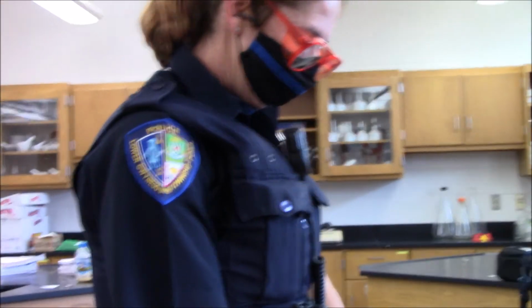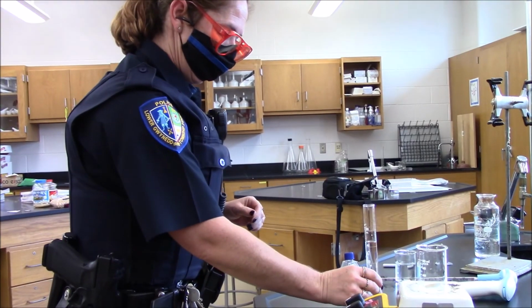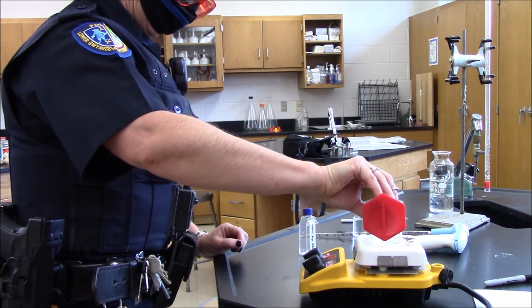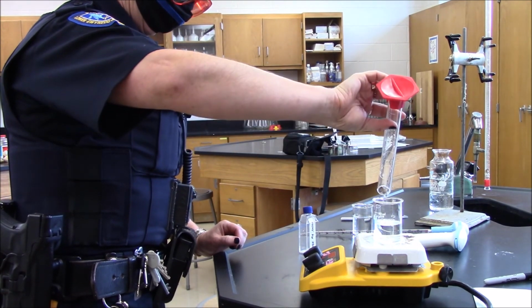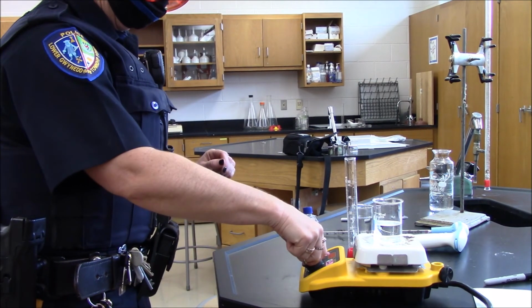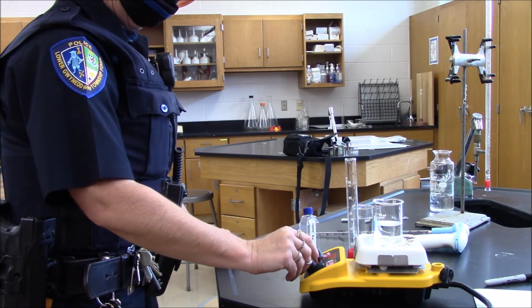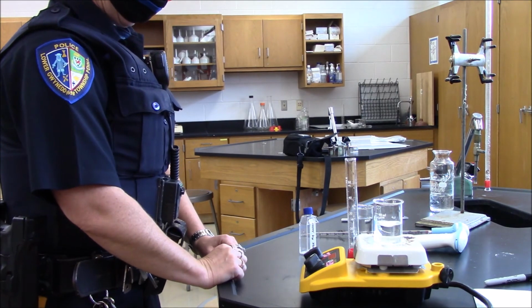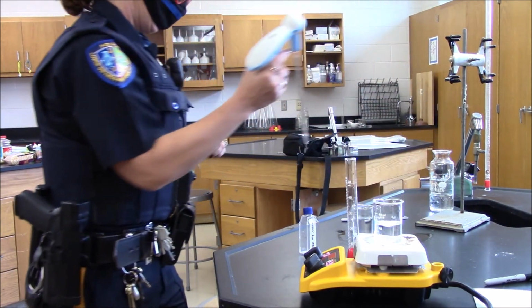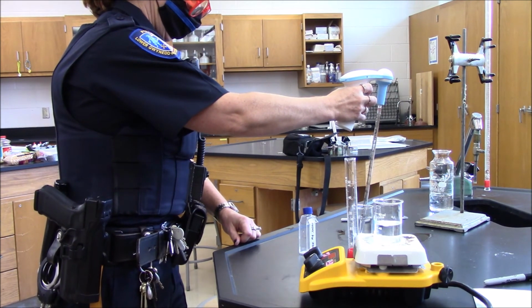All right, so now what we're going to do is take the liquid in the cylinder and put it in the beaker on the hot plate. Okay, and we can turn the stir on. It's the knob on the right, maybe a quarter of the way, just so that it's mixing. That's good. Now take that white and blue pipetter, and take 10 milliliters of the liquid in the beaker.